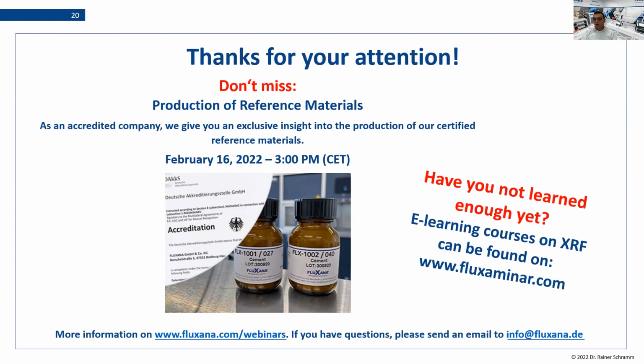There's another question. Is it advisable to prepare a calibration for fused beads with proper calibration standards, or is it just for pressed pellets? When you do a real dedicated application where your standards are prepared in the same way as your unknowns, it always will give you the best result. Sometimes you can also use standardless software where your preparation is like an ideal sample, like fused beads.